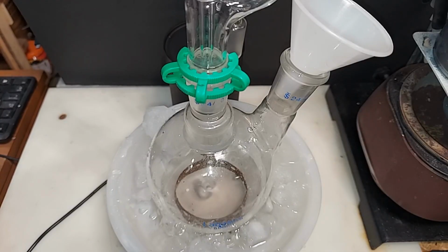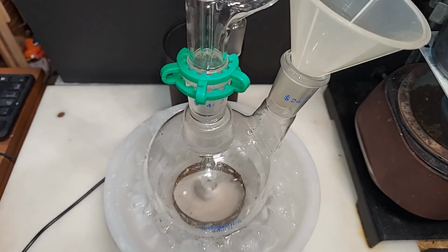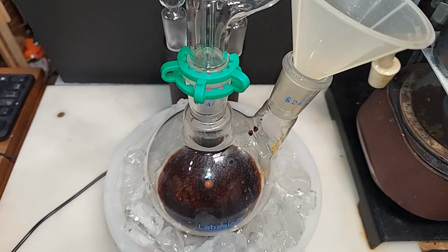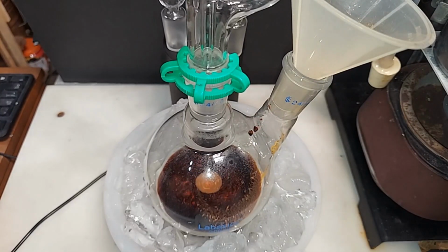Okay, the next step, adding the potassium dichromate. Here's our potassium dichromate, and I'm going to be adding this extremely slowly. I'm just adding the last of the potassium dichromate here. It took me about 45 minutes to add all of it. And we have a very strong oxidizing mix down there.